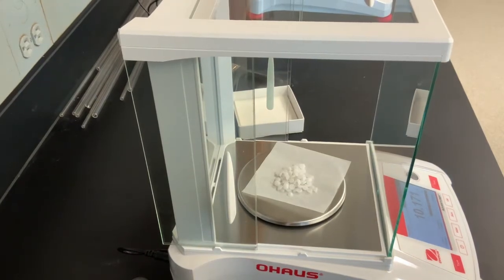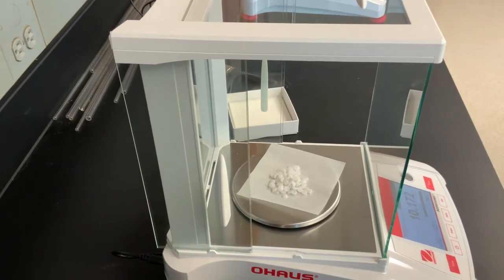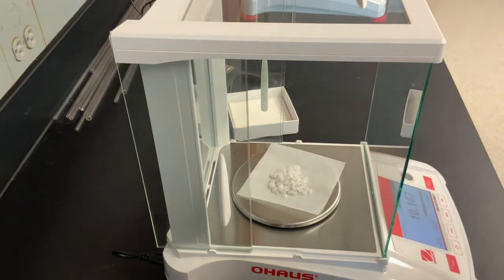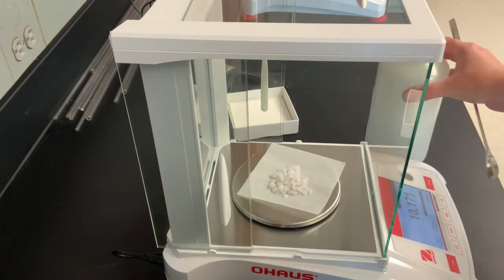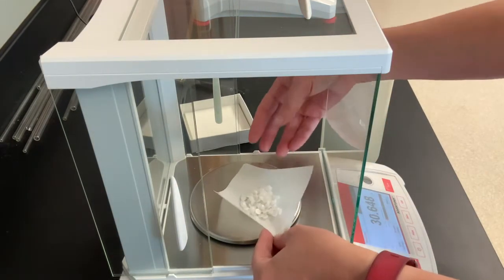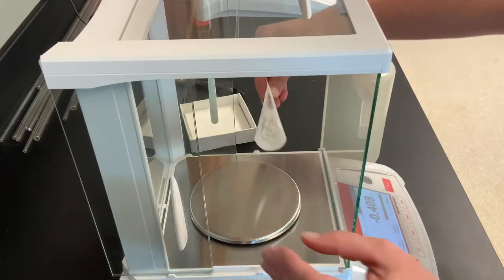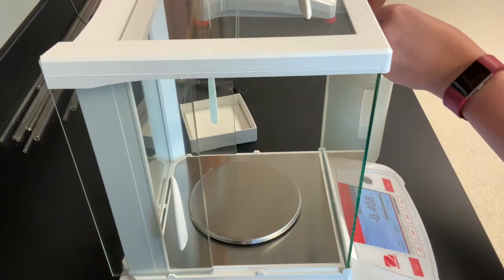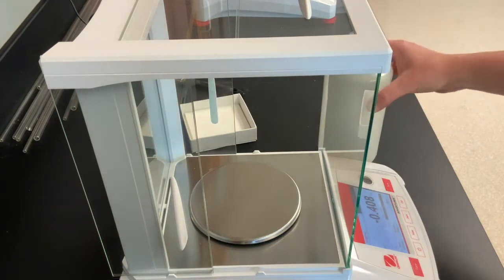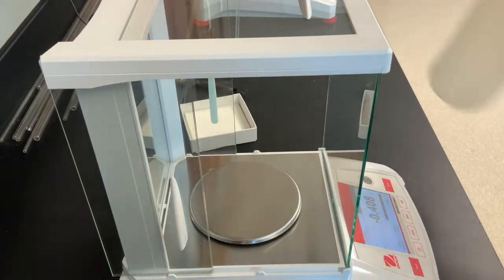So we've measured out our sodium hydroxide. You can see the mass on the balance here. Next thing we're going to do is transfer that sodium hydroxide to a liter bottle. And then we're going to add some deionized water to that bottle.